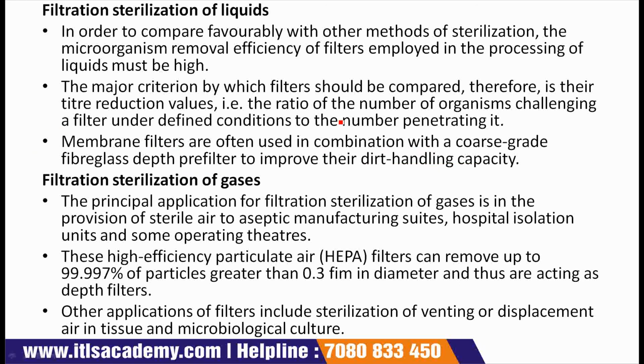Filtration sterilization of liquids we have completed. Now next one is filtration sterilization of gases.